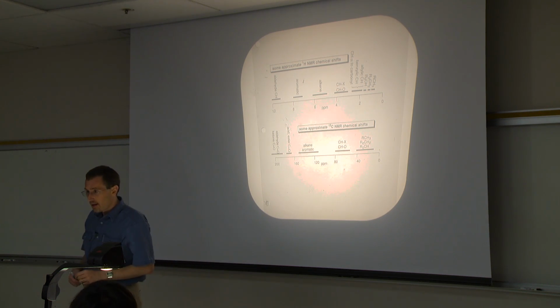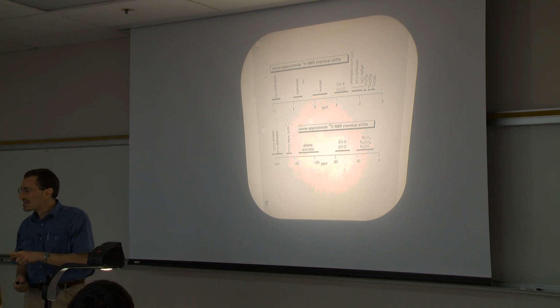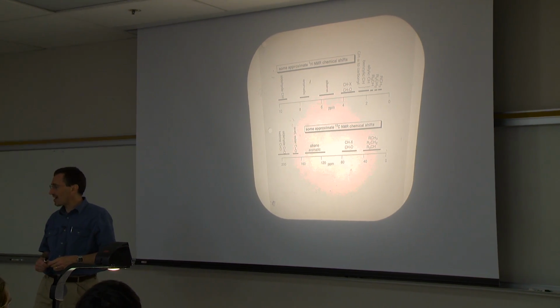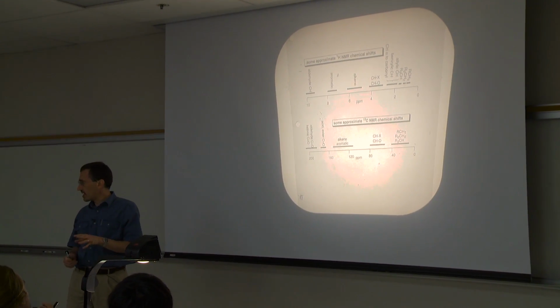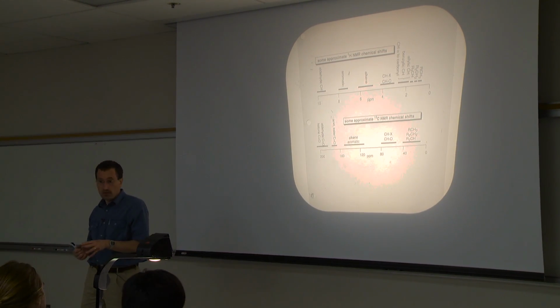Student: When you say you basically read it off, is that kind of like the reliability of IR, where it's like 1700 carbonyl kind of thing? So the question is, when you read a spectrum, is it the reliability of IR? I would say yes, in the way that there are sometimes surprises in the IR.